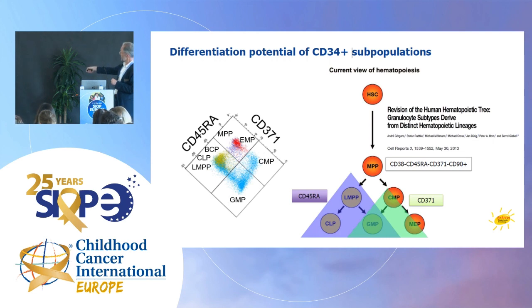And there it separates again to go into really lymphatic, or back also, and this is very interesting, it goes by both directions, it goes into granulocytic, monocytic precursors. So this is actually what we represent with our plot, which we have defined by these two double markers. You really can have this way or that way. And by that, we can quantify the repertoire of differentiating CD34 positive cells in a sample.